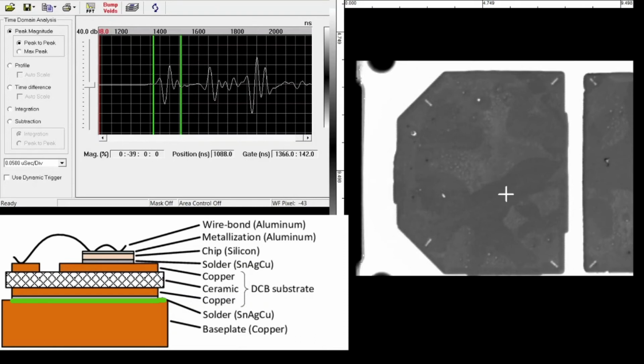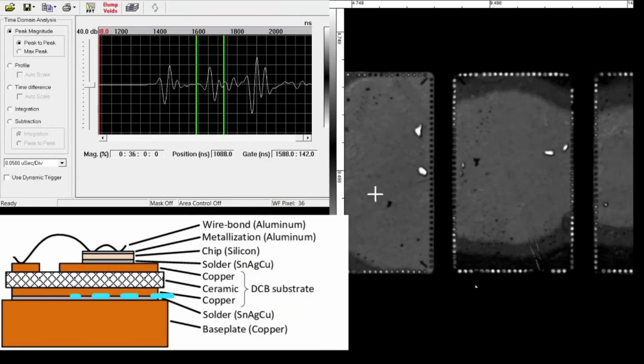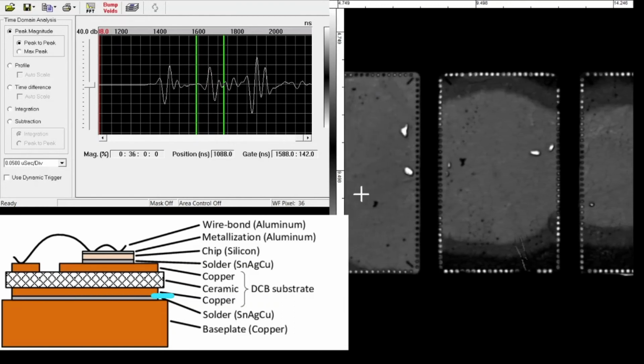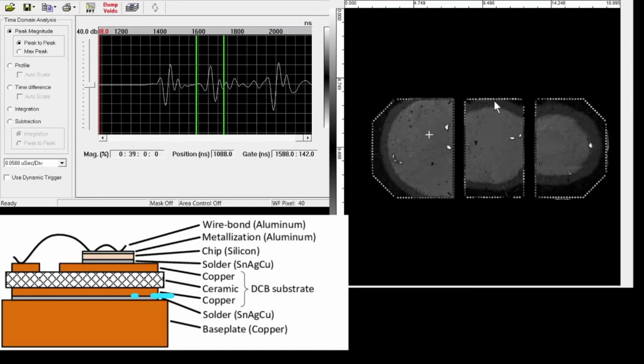So looking at the cross section, the next interface would be solder to copper. So going through the solder to copper interface, and let's refresh that. There's some larger voids there that we've detected. Obviously the bright regions again are voids, dark regions or grey level is uniform bond. If I zoom back out again a little bit, we're not really getting a complete image across the entire solder.